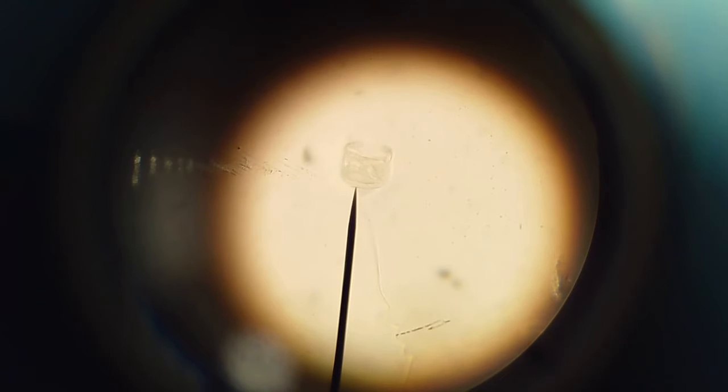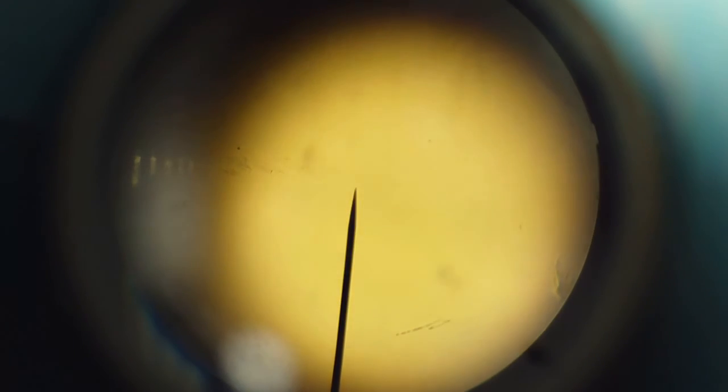There he's coming, there it is. That's a vorticella. Two of them, there's a couple, three right next to these. See if we can get this to come in just a smidge better. There's three of them.